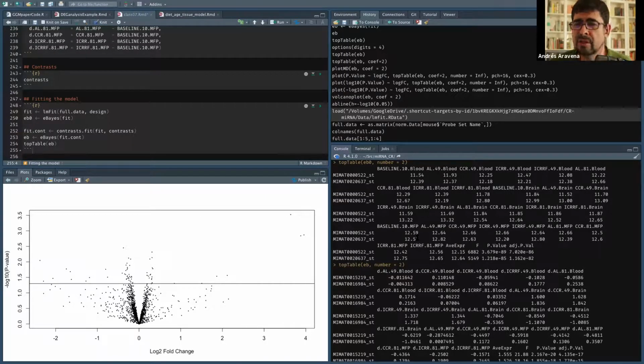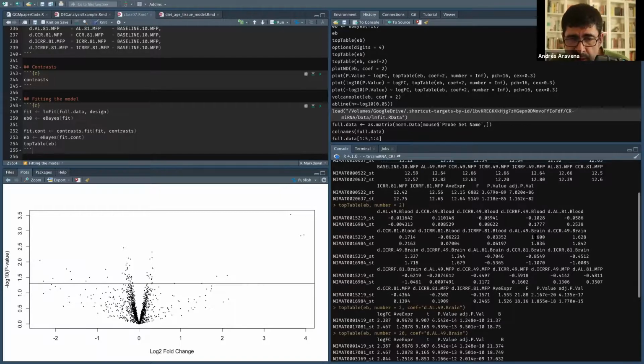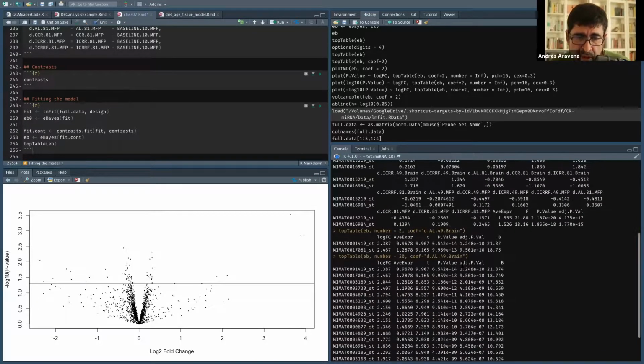I don't know in Windows, sometimes you can write Greek letters. I wanted just to show you something. I was choosing this gene, 1521-9, because in brain it was 1.6, and then I went to brain and I asked for the top 20 of ad libitum brain, and I found the same gene. Yes, and the log fold change is 1.6 again, but the p-value is different because again it's a different question.